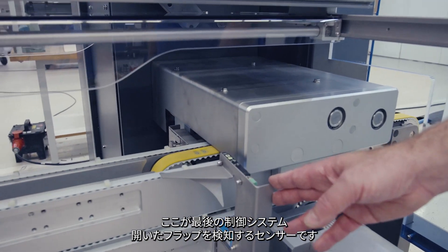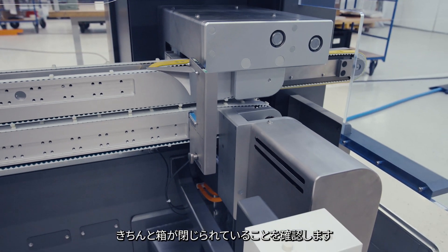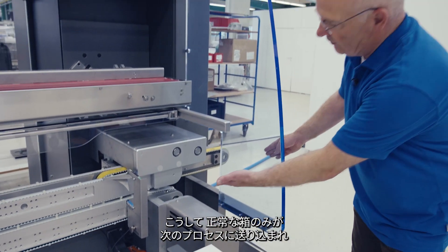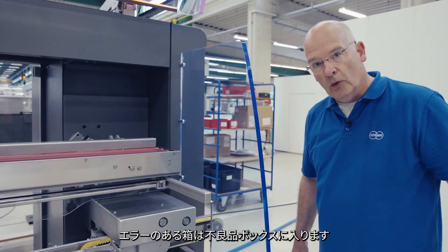The last control system is here — it is the sensor to detect an open flap. By a light barrier, we can detect protruding elements of the carton and decide whether closing has taken place successfully. Only good cartons are placed onto the downstream equipment.